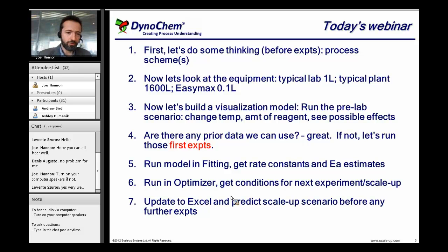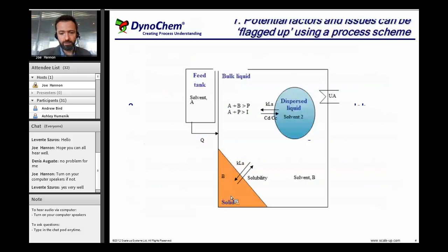So it is quite a different way, I would say, of working compared to a lot of what we see in the industry, where people's first response to any issue is to run some experiments, and sometimes to run a lot of experiments and then do some thinking at the end. Here we're trying to reverse that whole process and do the thinking up front so that we do fewer, more informative experiments.